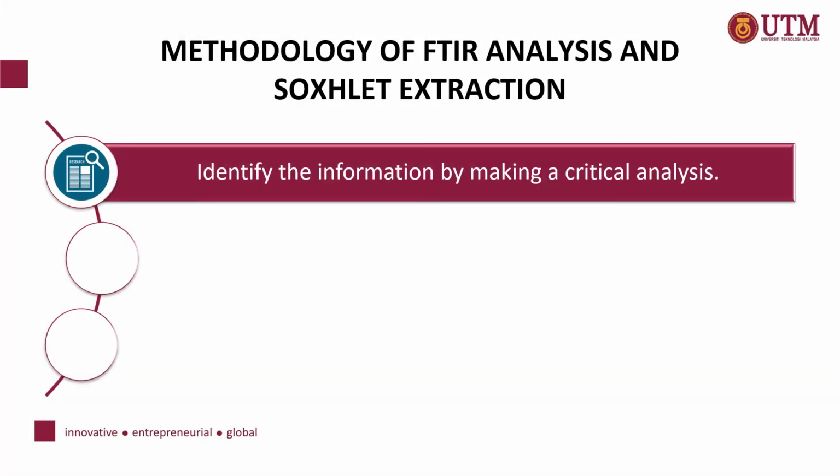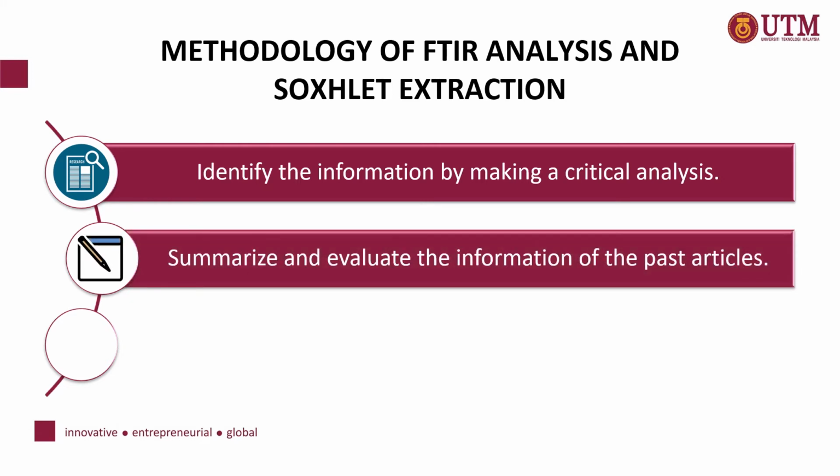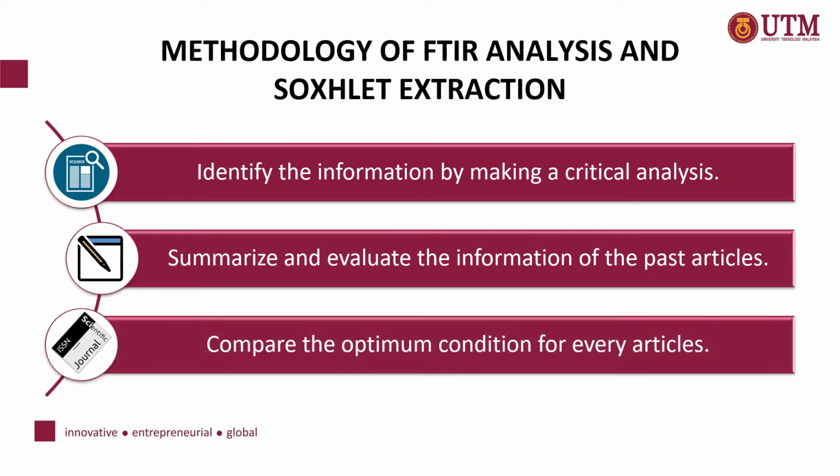For the methodology of the other objective, firstly, identify the information by making a critical analysis of the FTIR analysis and SOXHLET extraction process. Next is by summarizing and evaluating the information of the past articles. And lastly, by making a comparison for the optimum condition of FTIR analysis and SOXHLET extraction process on the previous articles.